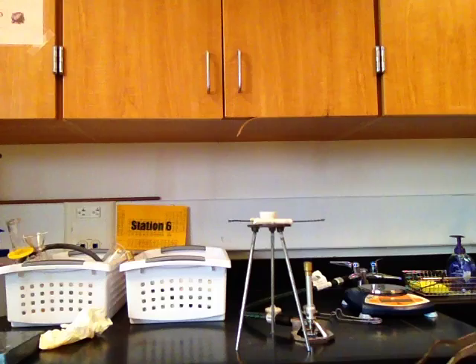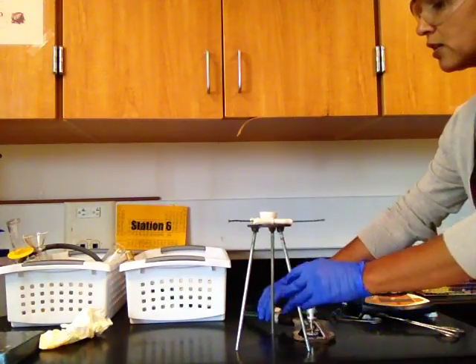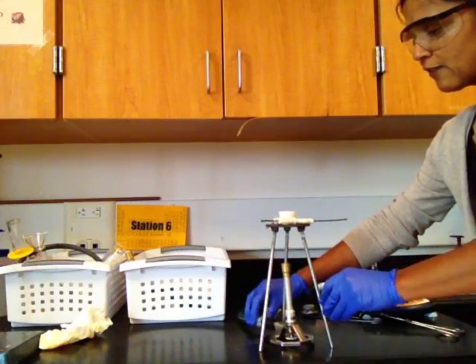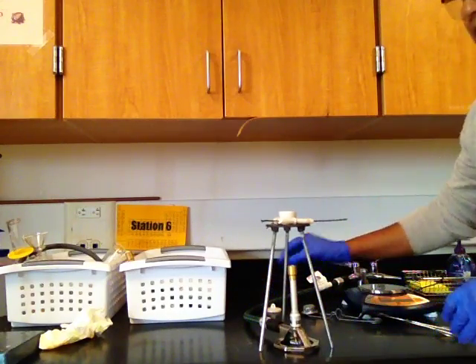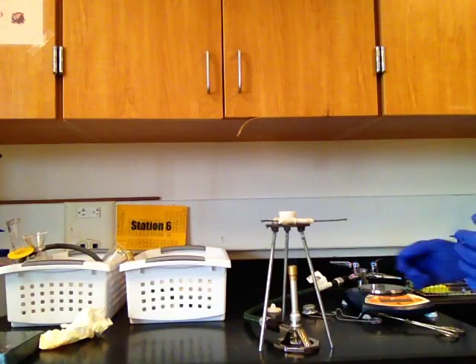But to be sure that all the combustible impurities have been removed from your crucible, you will need to repeat this procedure. Reheat the crucible for another 2 to 3 minutes. Cool it down again, reweigh it till the mass is within a very small range of difference. We call it the mass becoming constant. That means that you have burned off all the impurities. Now your empty crucible is ready to be used.